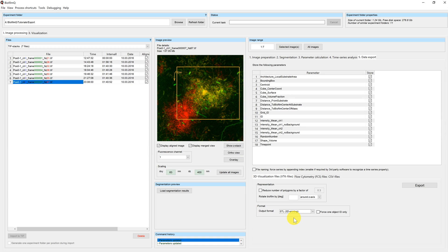In our case we used the STL format to create files which can be printed by a 3D printing company. At first they struggled to print our biofilms because they had multiple object IDs in them. This is the reason why we included the checkbox 'force one object ID only in biofilm cube.' In this tutorial I will show you the VTK format.